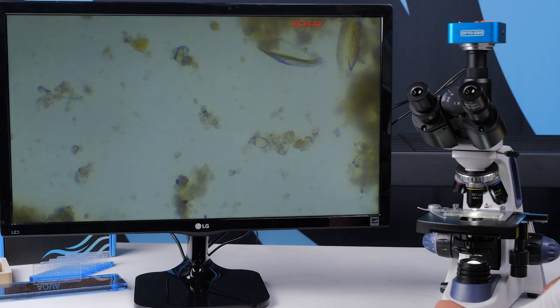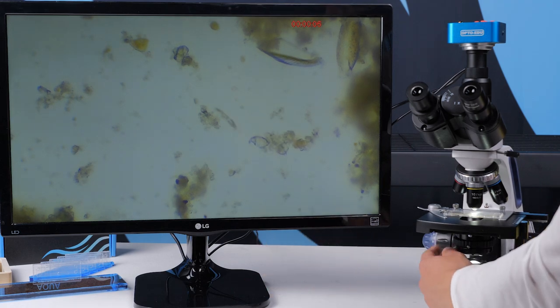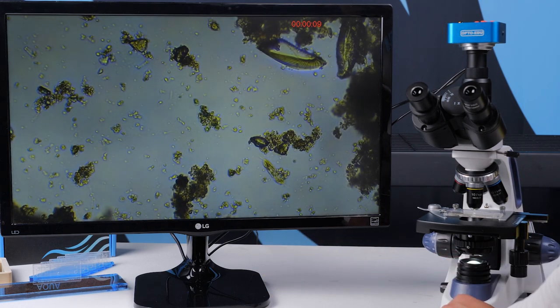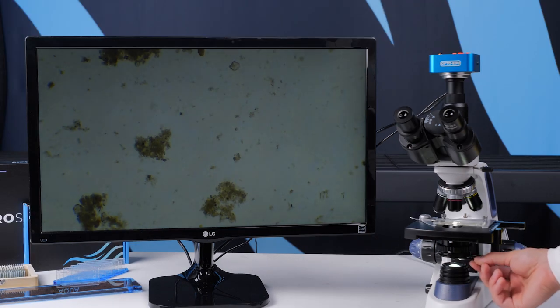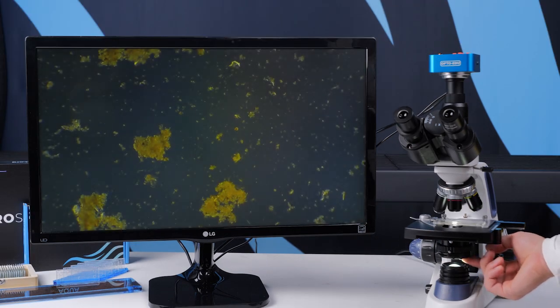You'll typically want to use the microscope in transmitted light illumination mode and typically you'll want the condenser iris closed almost all the way down. Larger organisms and colorful algae will typically look the best in darkfield mode.